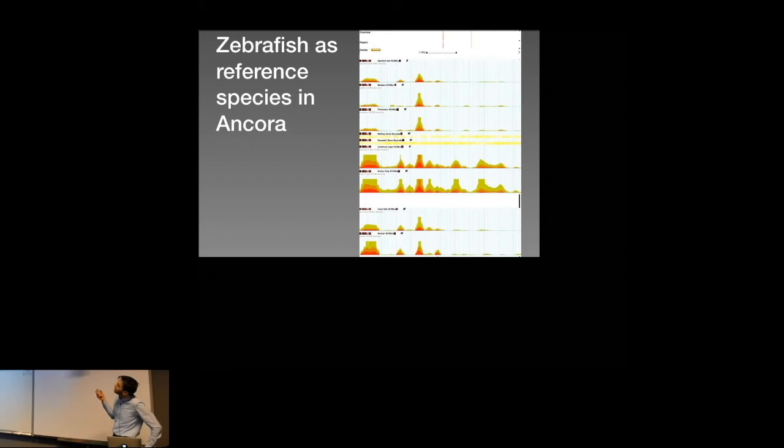This is just to show up to 3 different essentially bed file tracks, and there's nothing special about it, and any visualization that can show multiple density tracks can show these tracks.